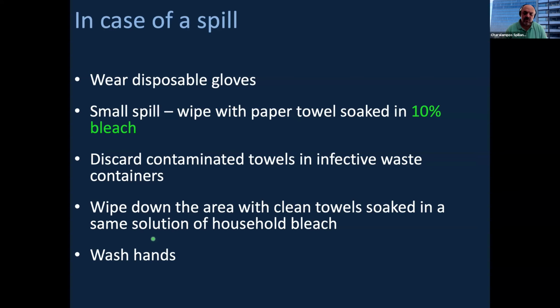So you need 30% water to dissolve the microorganism, and then you need the 70% ethanol in order to dissolve, for example, membranes of the microorganism and kill it. So 70% ethanol would be a great disinfectant, and what we usually use in order to disinfect our benches.